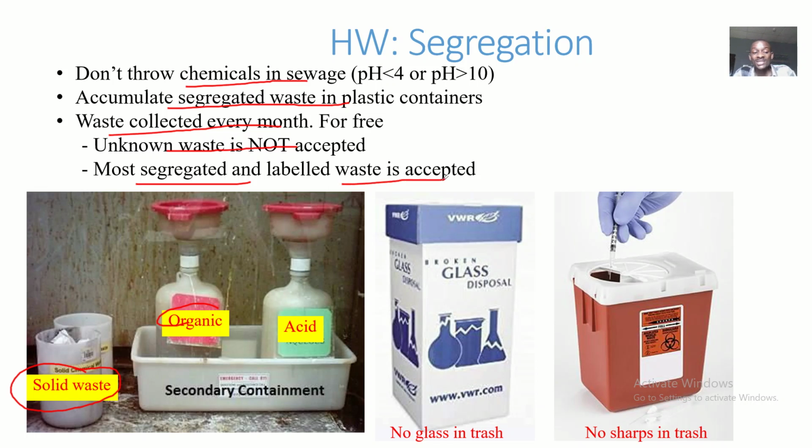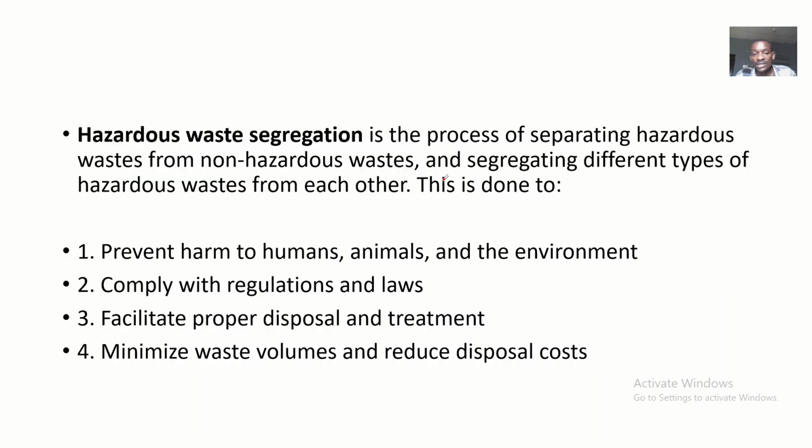Sometimes you could go as far as labeling your waste, saying this one is waste from this type of reaction that we did, and this one is waste from that type of reaction. Do you understand? Hazardous waste segregation is a process of separating hazardous waste from non-hazardous waste.